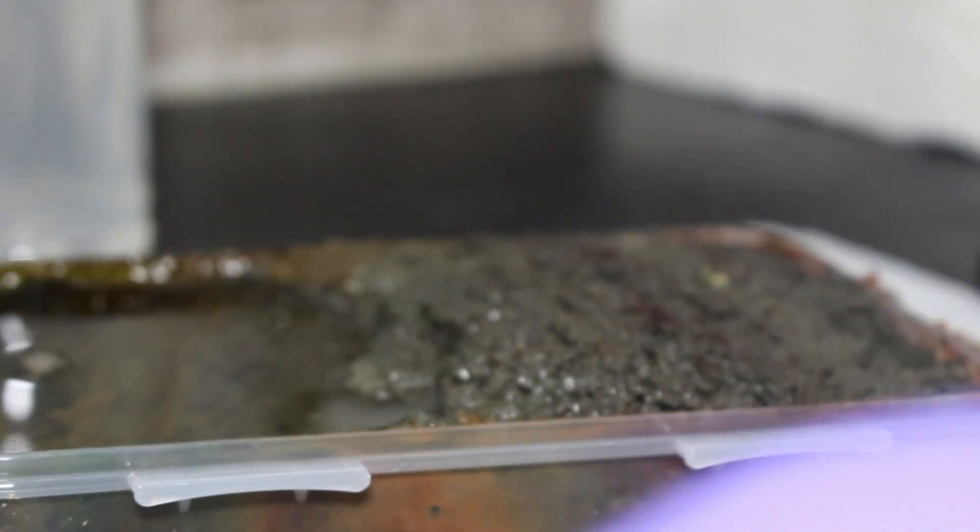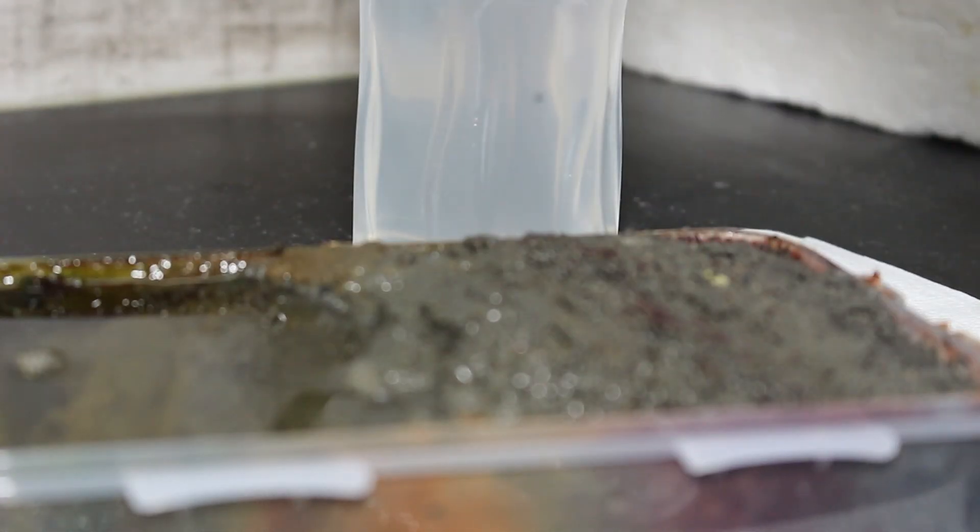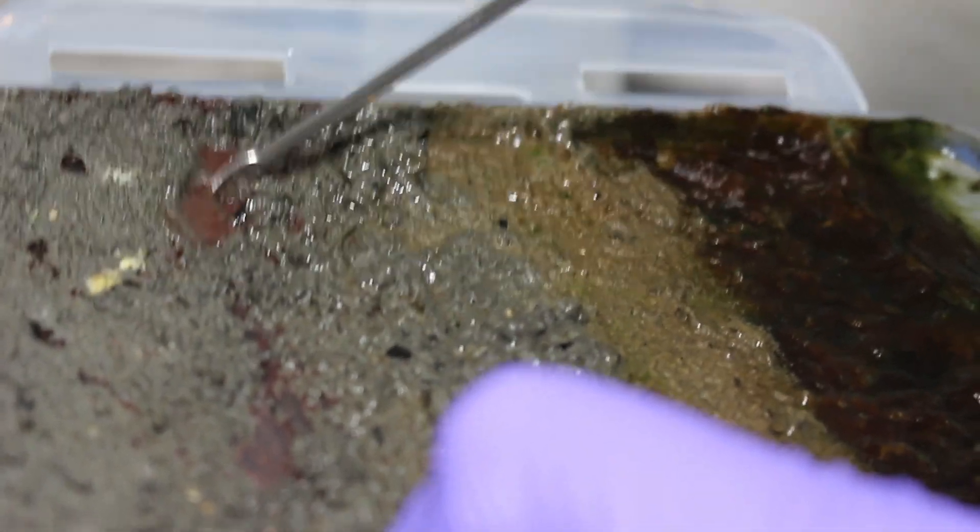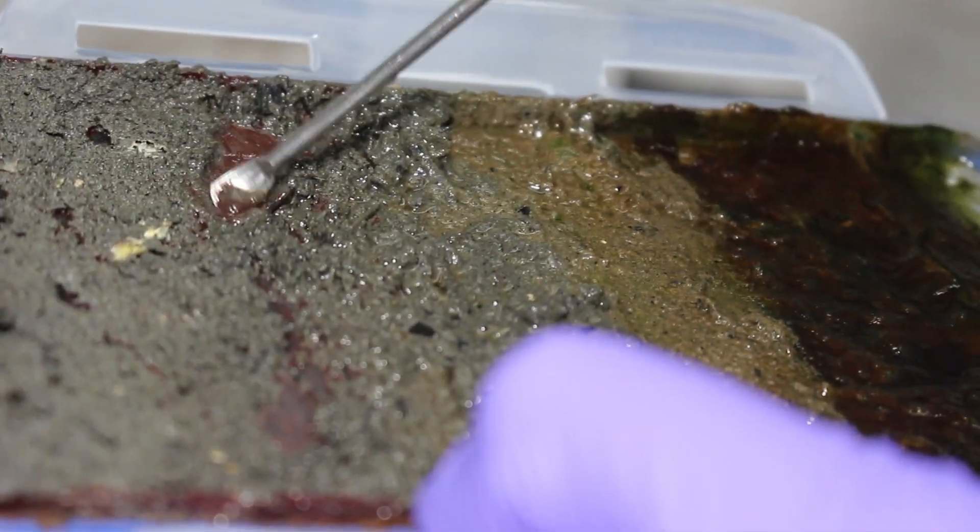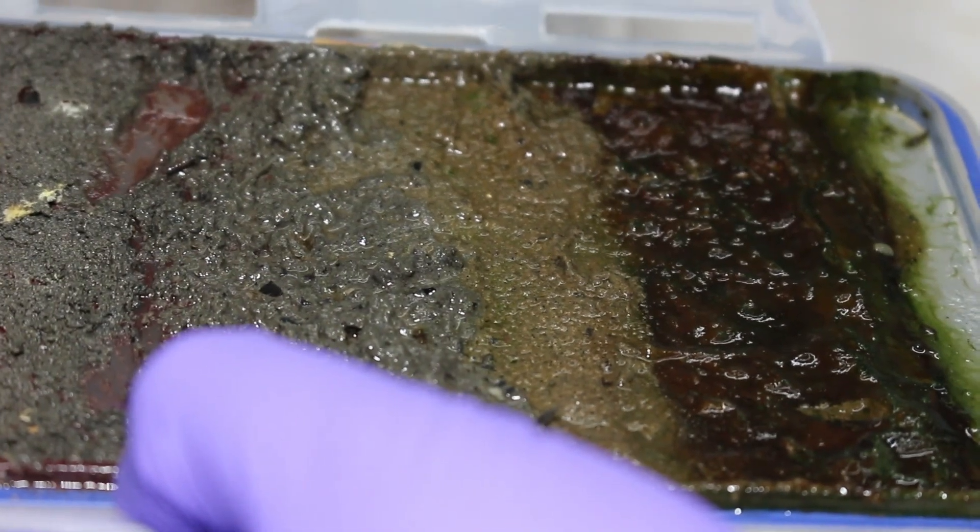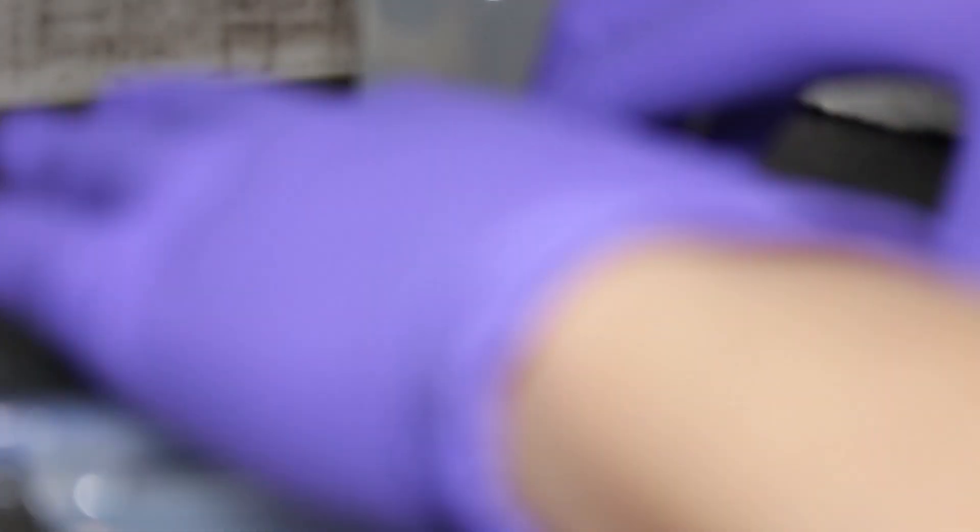So after a few months, what's the result? The result is they all failed. None of the growth medium actually came up as what I expected. But I don't think it is a problem with the growth medium. I think it is a problem with oxygen. Simply to say, when I open the box, bacteria grows inside the box, get into contact with oxygen, so the bacteria just died. And if you have bacteria already died, it is quite normal that you couldn't culture anything out of it.